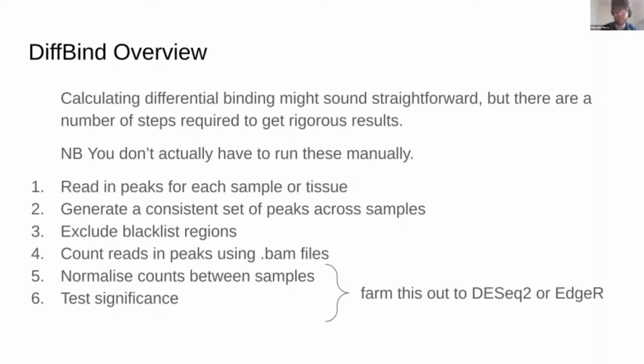Does that make sense? Yeah, you could also create some kind of an overlap collection of peaks from the individual samples. So in a way, you're having two levels of unifying the peaks. Yeah, I think that's correct. DiffBind does actually allow you to do that. In fact, I'll come back to that in a second when we look at the peak calling sets. But yes, it's entirely correct.